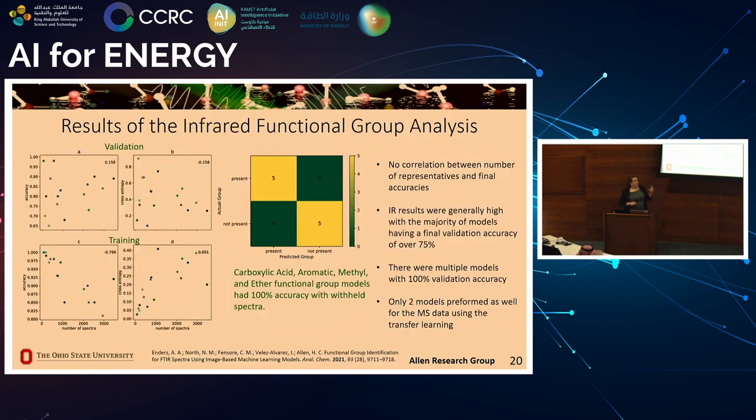So when we pivoted and started looking at this, originally the goal was to use transfer learning. The reason that we did this was because you can really save a lot of computational expense and you can have a higher level model with less computational resources with this transfer learning. This entire process had been done by transfer learning on Inception version 3, which was originally trained on the ImageNet database with relatively good results.